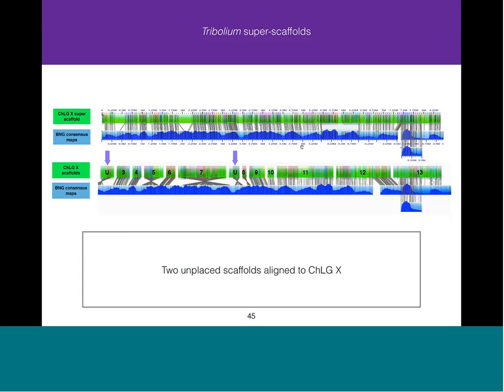Okay, great. Next one, have you generated any BioNano data for related species of Tribolium and seen how they aligned to the in silico CMAP? Yeah, so our closest relatives don't seem to be aligning very well to Tribolium, but we are working on it. Okay, great. Wait, sorry, we were told that a while ago. It looks like Fremani aligned to the Tribolium CMAP and Madden didn't. So yes, one did, one didn't. Right?